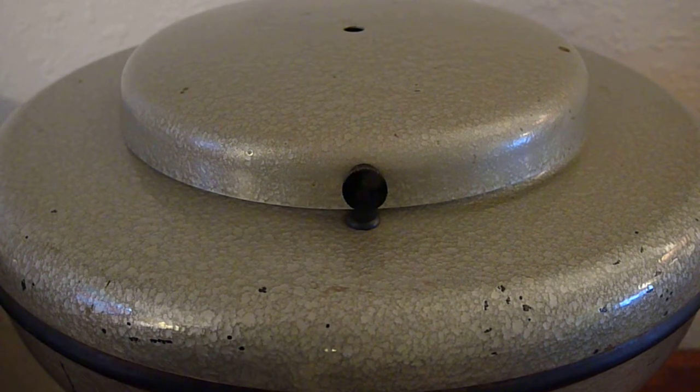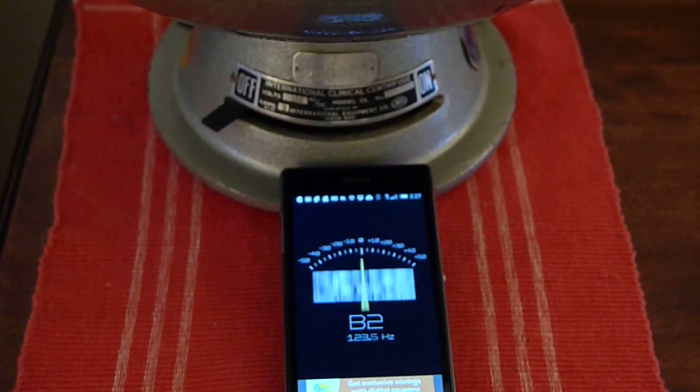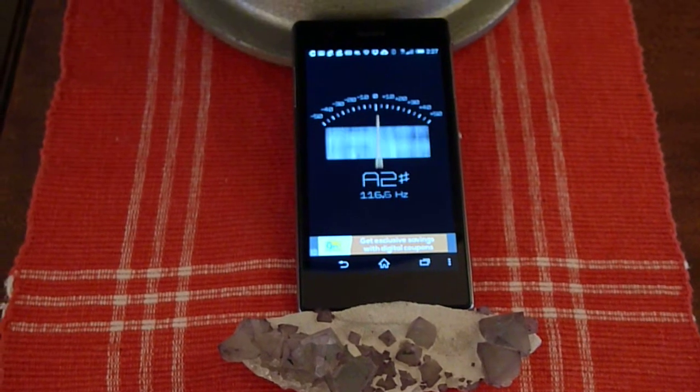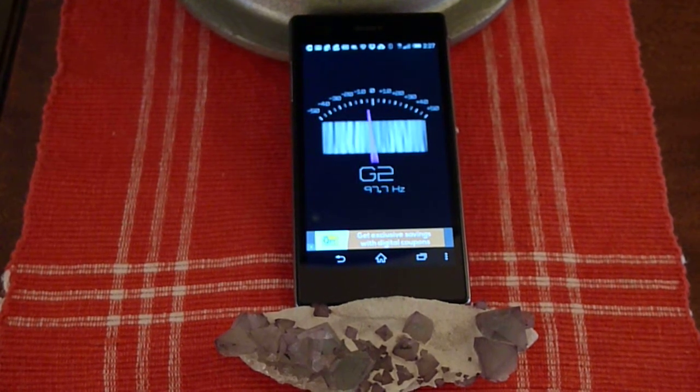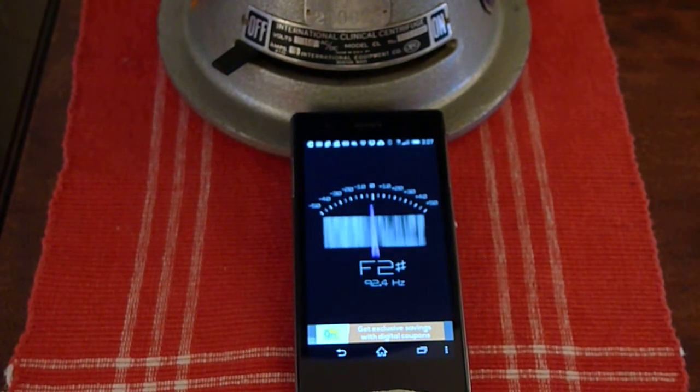Let's spin her up. I should show you that part here. As you can see, I'm holding my cell phone in place with a rock. But it's more fun if you can see the controls.